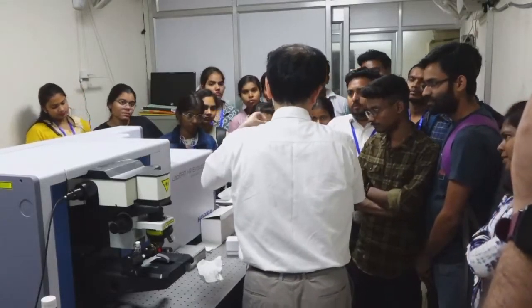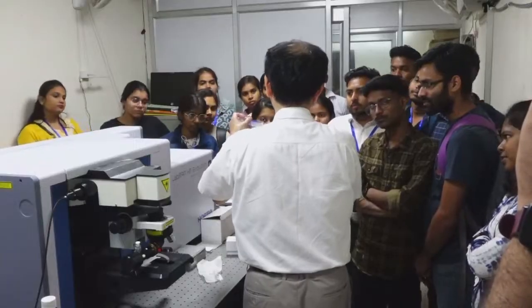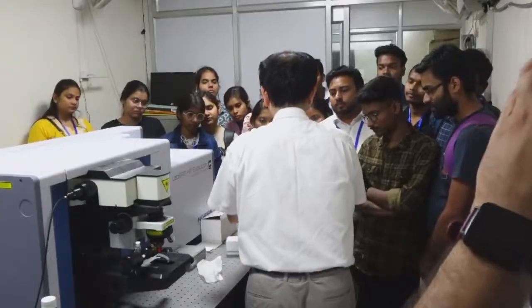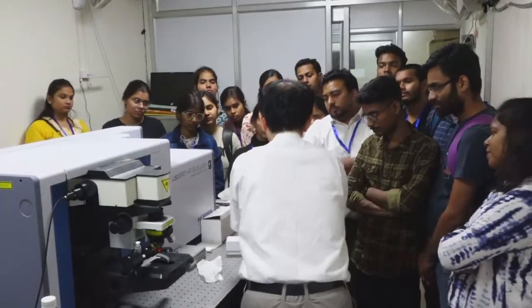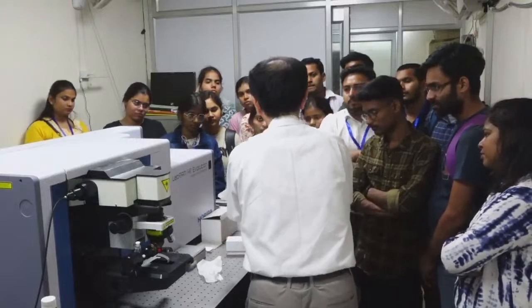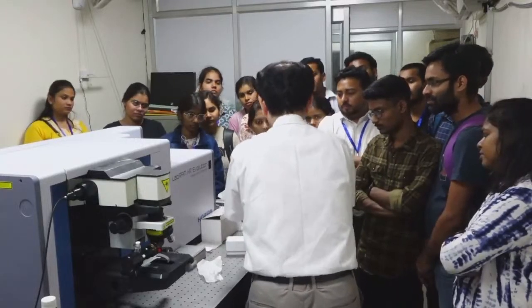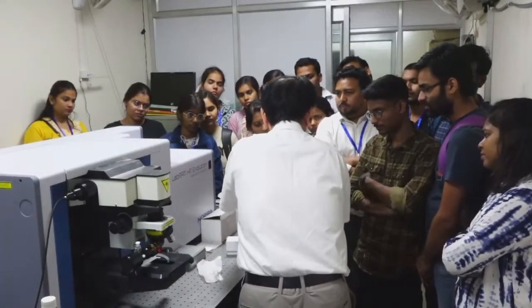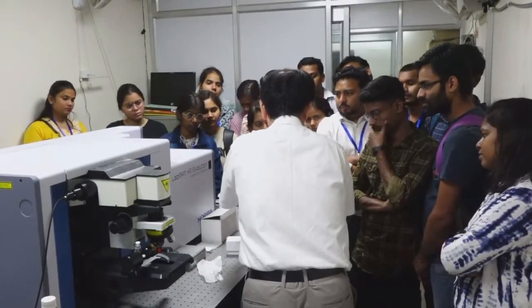It depends only on the numerical aperture of these optics. If the optics can gather signal from a larger solid angle, then the signal count becomes larger. If this is a small lens, it only gathers a small solid angle, then it is less efficient.